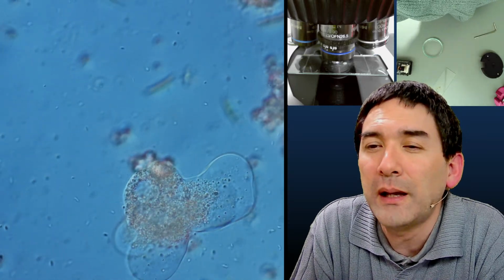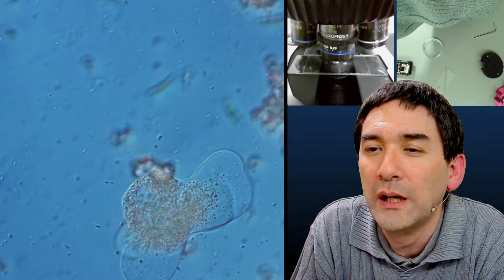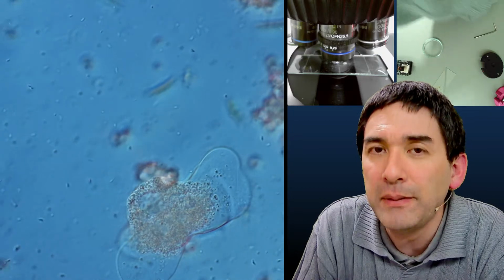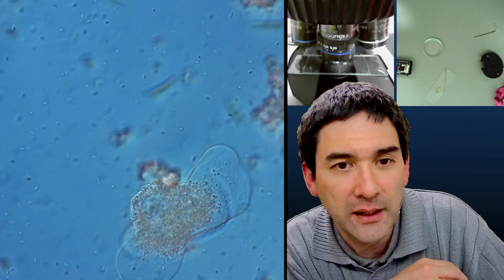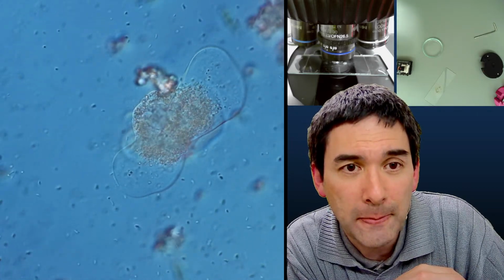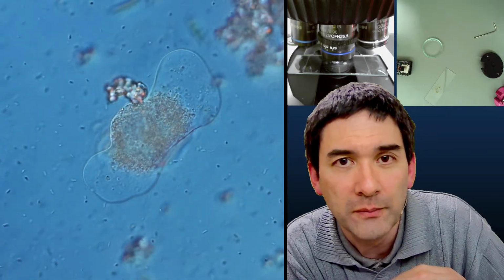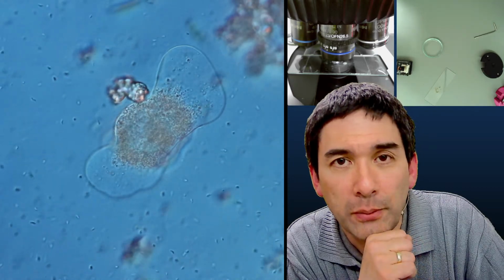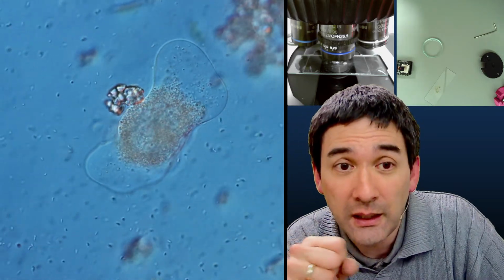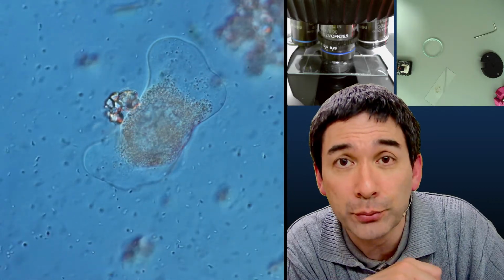The middleman helps ensure the quality, with a higher price tag. For example, when buying scopes from the Big Four, most of their parts are made in China. Yes, the Big Four are Nikon, Zeiss, Leica, and Olympus. When you buy a microscope from them and get it configured, they will buy the individual parts and assemble them, but the parts are sometimes imported from China, from Japan, wherever they are made. However, those parts are proprietary.